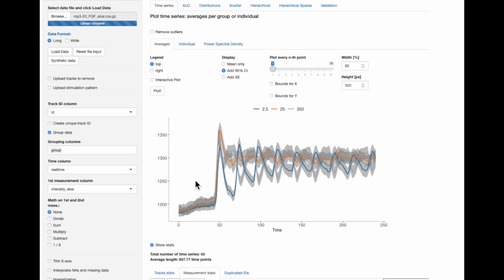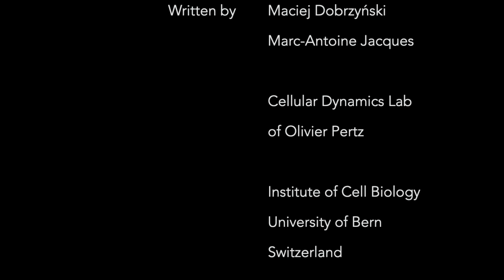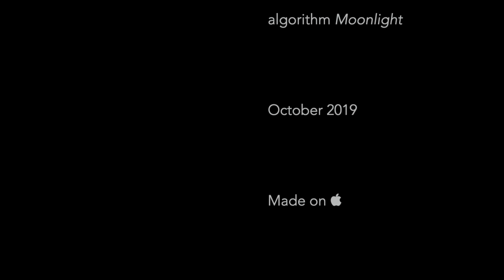With this analysis, we have discovered that the pulsatile treatment of cells with an increasing dosage of a growth factor leads to a phase shift. Single cells respond in unison to pulses at a low and high concentration. At high concentration, the responses are in antiphase with respect to the stimulus, and at the intermediate concentration, we observe a mixture of in and antiphase responses. We have discovered that using clustering of time series. This is an important piece of the puzzle that allowed us to define and select mechanistic models of this process.